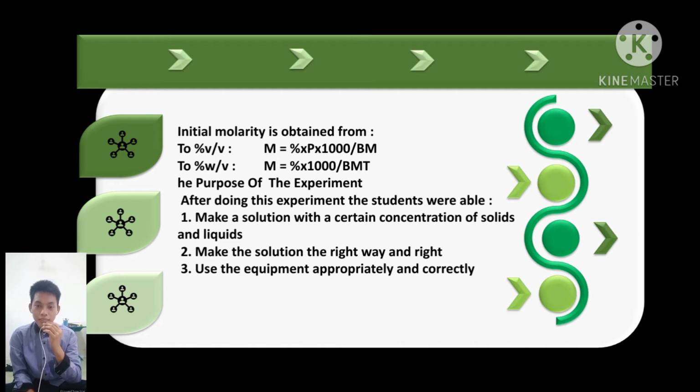The purpose of the experiment. After doing this experiment, the students were able to: 1. Make a solution with a certain concentration of solid and liquid. 2. Make the solution with the right weight and the right volume. 3. Use the equipment appropriately and correctly.